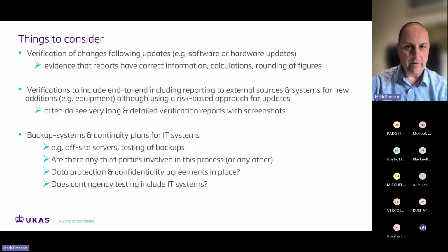It's the initial verification. It's important to do these, obviously, but also following any updates. I have seen instances where a seemingly minor software change occurs, but it's actually affected something down the line, and you might find the formatting of the results being changed, or the units disappear, or something like that. So do make sure that with any change to a system you do a level of verification for that. And assessors will look for these.